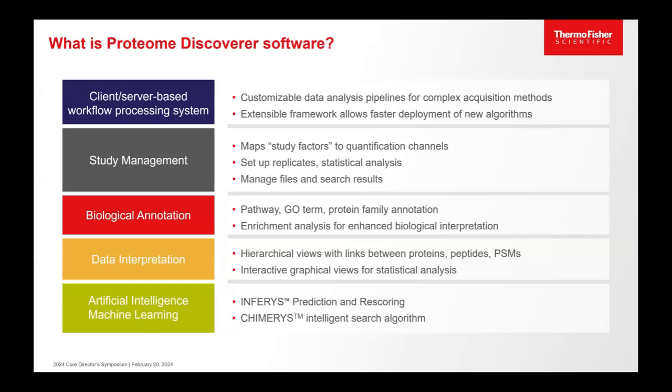We've also had services for biological annotation. So with the proteins, we'll add gene ontology terms, pathways, protein families, can do things like overrepresentation or enrichment analysis as well. A lot of work was put into the user interface to link the views between the protein list, the peptide list, PSMs, quant values, pathways, and also to the graphical tools. So the volcano plots, chromatograms, and so forth, and you'll see some screenshots of that later.